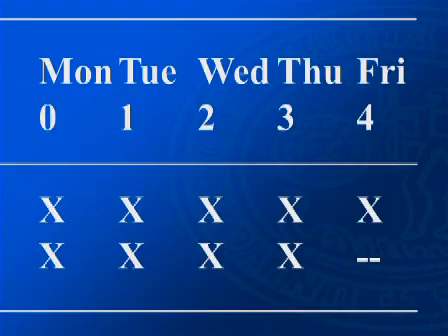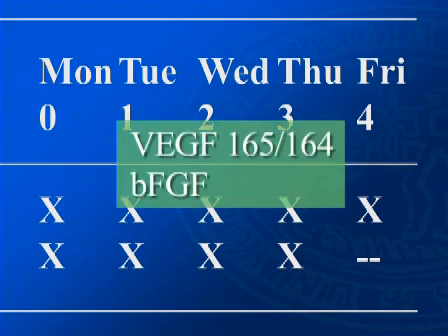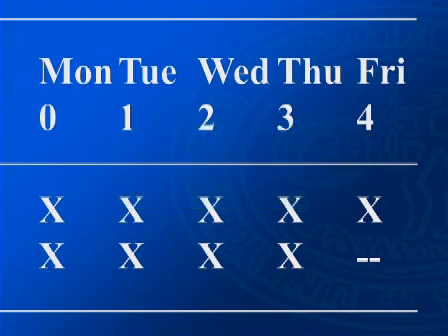The number of treatments may appear to be large, but it has been demonstrated that it is not always possible to induce statistically significant angiogenesis even when using such potent pro-angiogenic factors as VEGF and basic FGF when they are administered at approximately physiological levels in a single dose or few spaced-out doses. It should be remembered that potent endogenous angiogenesis inhibitors operate in the tissue.